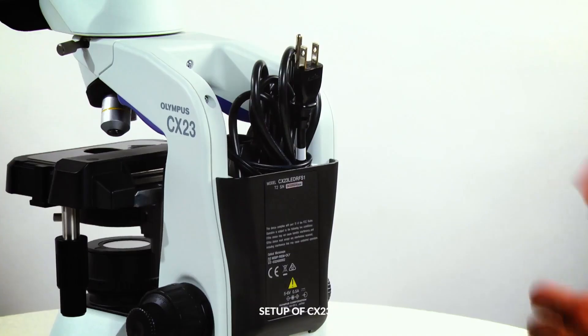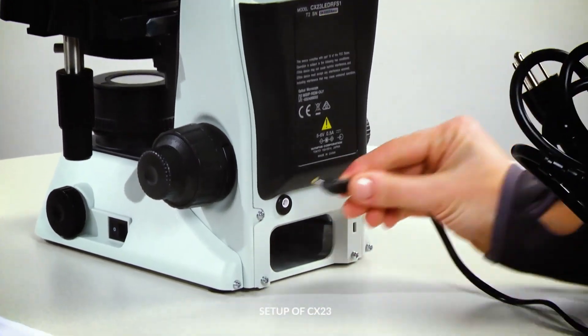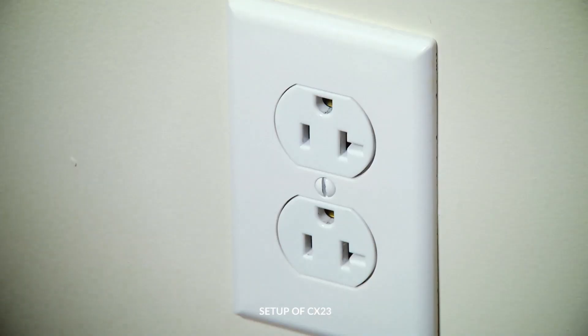To set up the CX-23 microscope, remove the AC adapter and power cord from the back storage pocket, connect it to the microscope, and then plug it in.